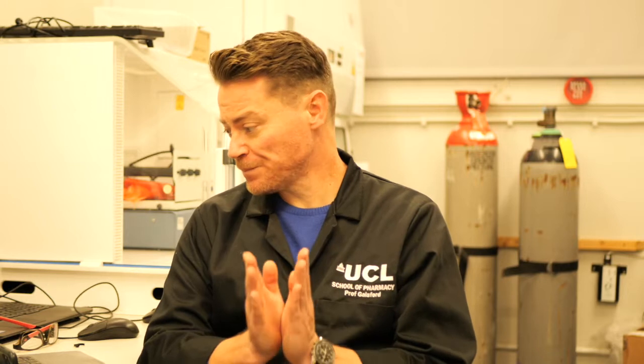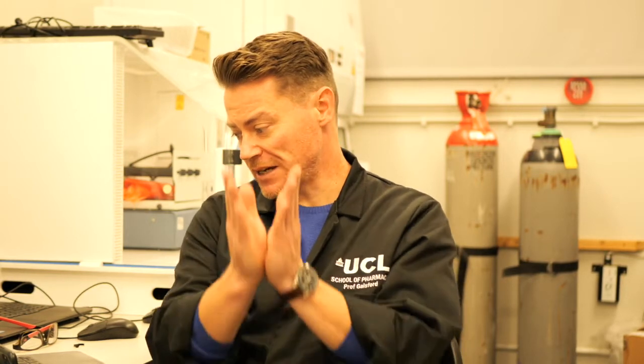Multiplied by sine of a particular angle, and that angle is related to the lens and the light that's coming from the sample to that lens as shown in the diagram. So you can see that the farther away from the sample the lens is getting, the smaller the angle. We want the numerical aperture to be as large as possible to make the value of R as small as possible. So in order to do that, we want the angle to be as large as possible, and we also want the refractive index of the medium to be as large as possible.